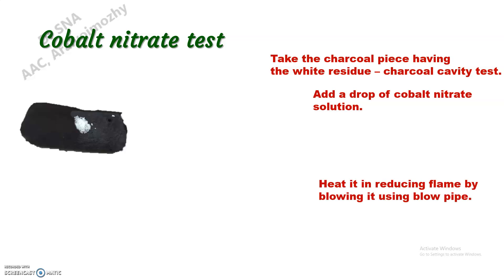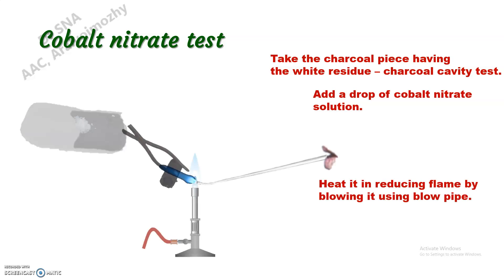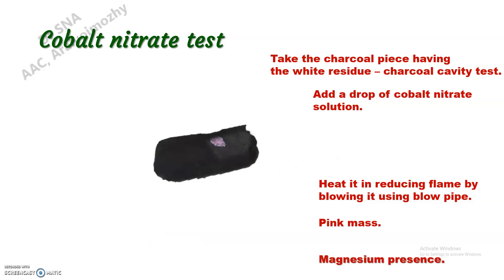Now we can heat it in the reducing flame using the blowpipe. After heating, we can see the white residue changes to a pink mass. This pink mass is an indication and confirmation for magnesium.